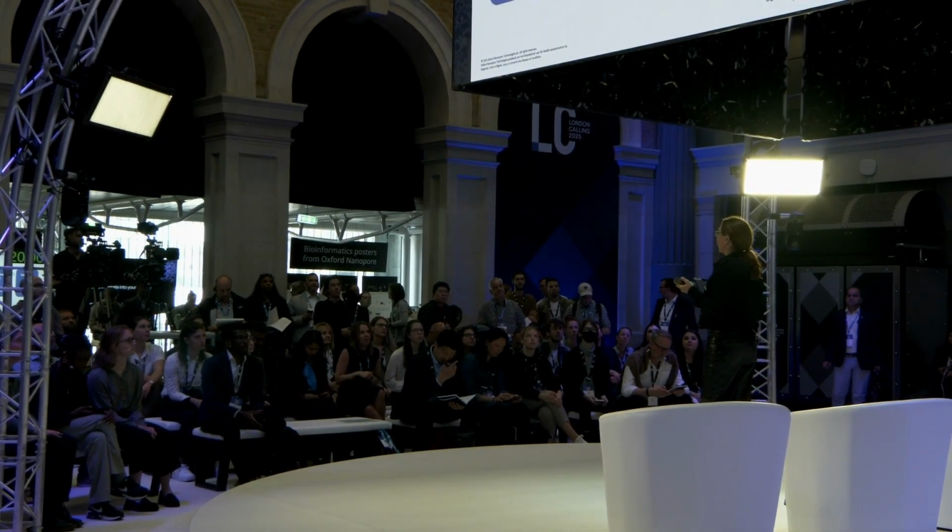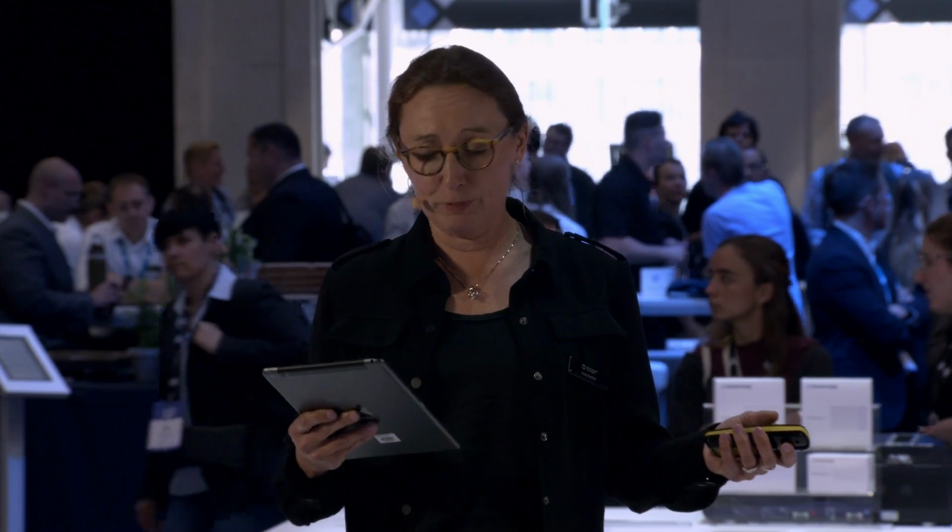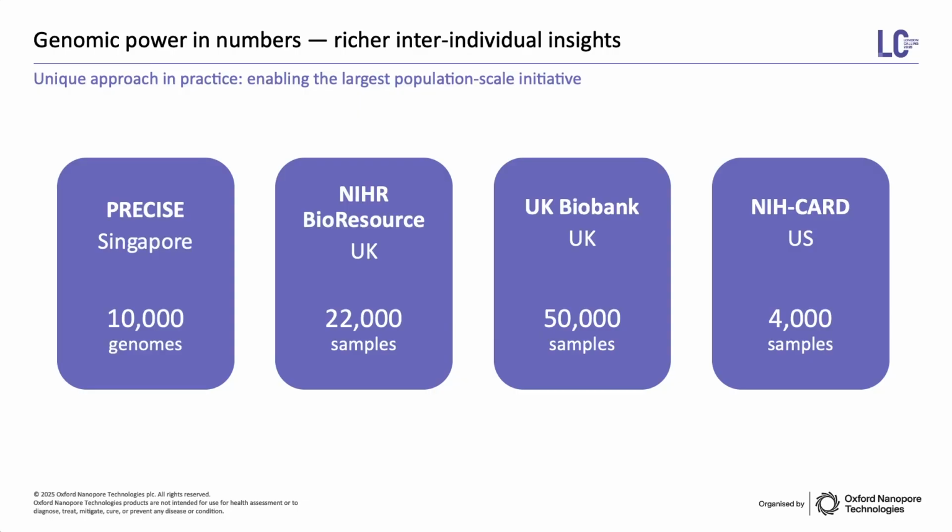But now, with Oxford Nanopore, it's really possible to get much richer insight on large groups of participants. For example, long-read sequencing typically identifies twice as many germline structural variants as you would get with short read. And obviously, you also get, with Oxford Nanopore, the methylation information simultaneously with your genomic information.